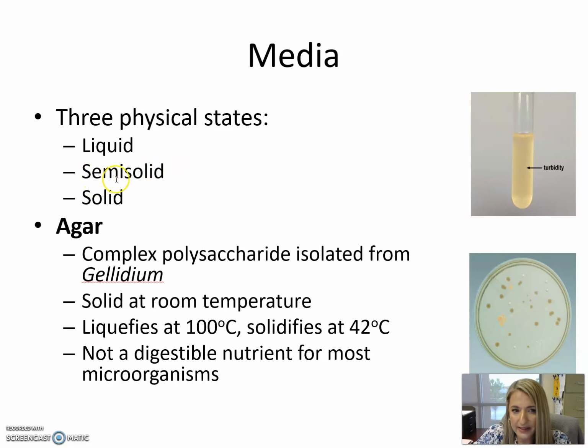Sometimes we will have a semi-solid media in these test tubes, which is somewhere between a solid and a liquid. Imagine a jello that hasn't completely set. We will often use this type of test to inoculate bacteria into and see if they were able to move throughout the semi-solid media, which provides us information regarding motility and the presence of motor appendages like flagella.